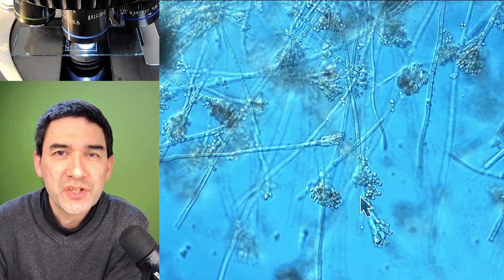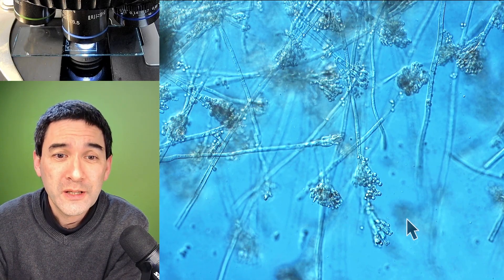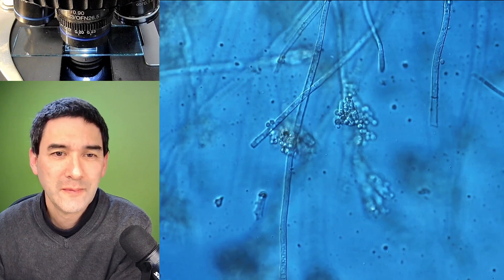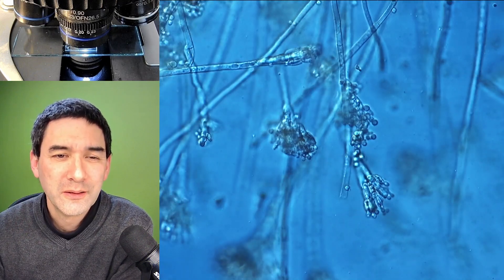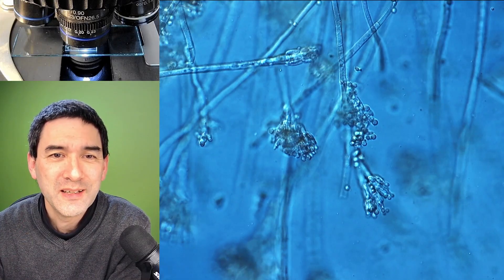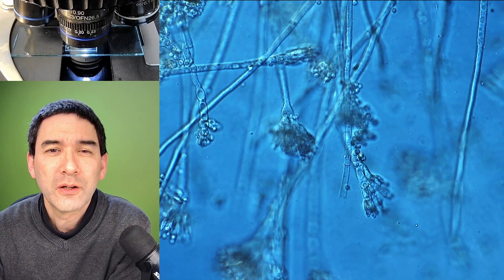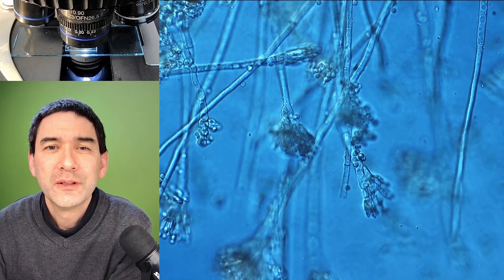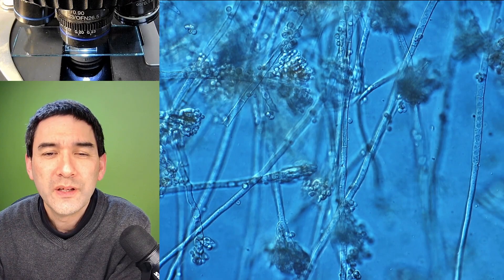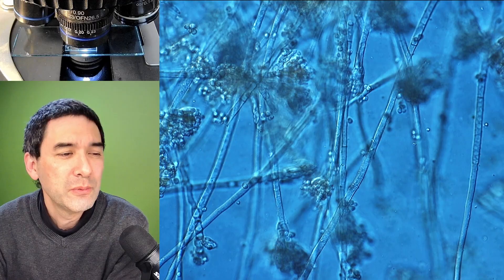Those spores will spread through the air and will start to form new mold. Let's zoom in a little bit more, let's have a closer look. To a certain extent, I do consider it quite fascinating and interesting. But there are a couple of other things that I found here. Maybe you can take a look at the tiny moving things here in the background. What could these be? I don't know — are you able to see those?